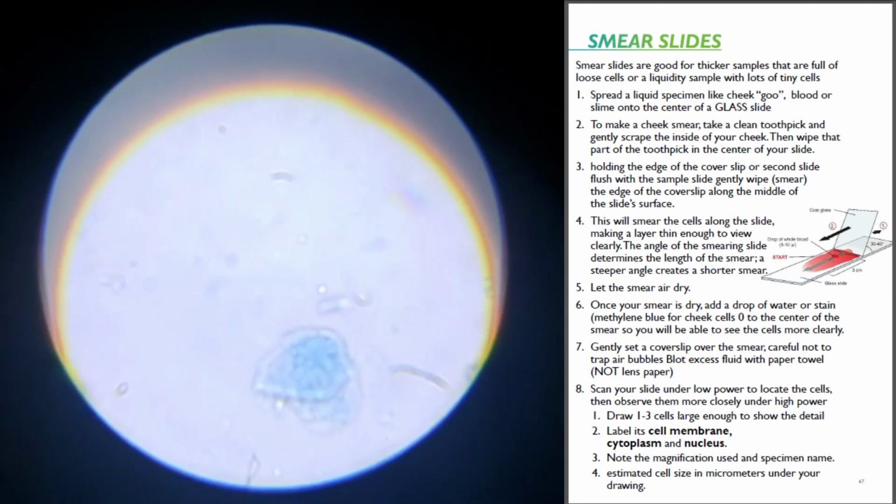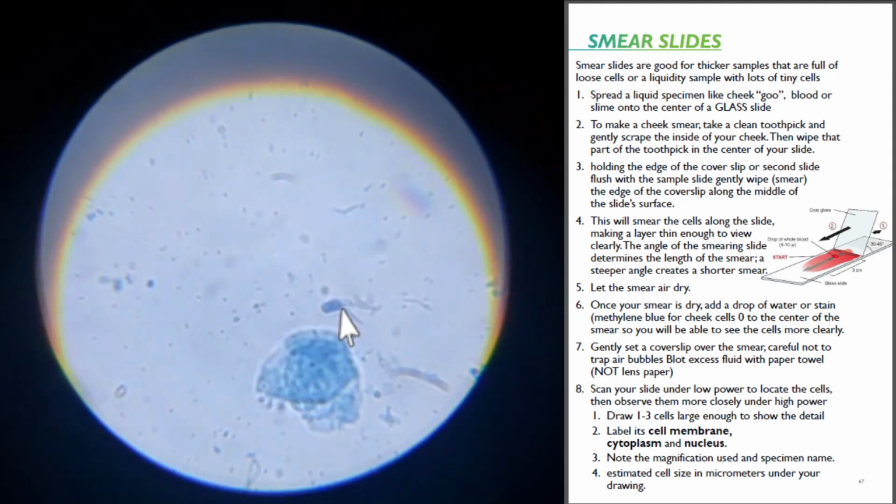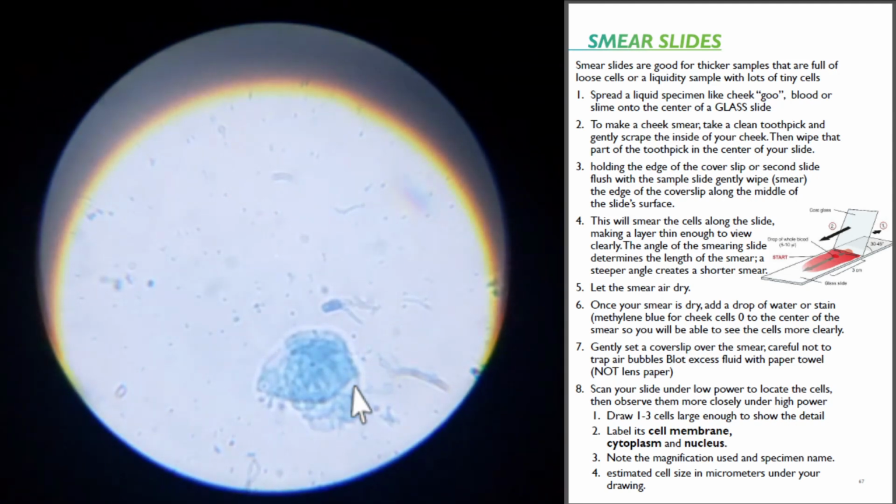I don't think I can get it clear. I saw something moving along the edge. Let's see if I can make this look a little bit better.